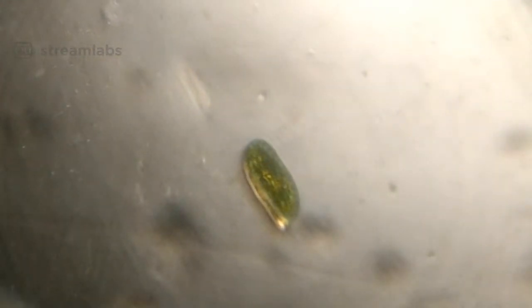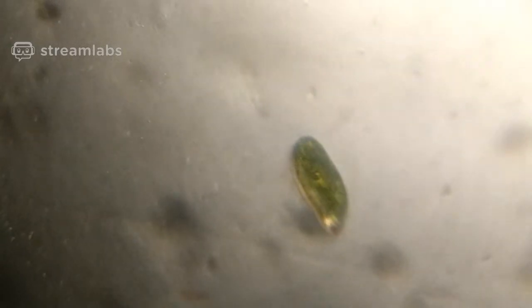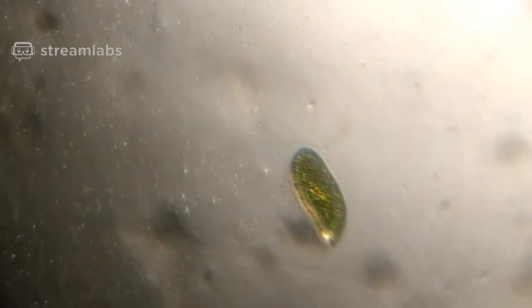Now there's another ciliate that I have put together for you. There he is. He doesn't want to move very much. This is Paramecium bursaria. He's kind of stuck there. What do you see inside him? It looks green. You know what it has done?